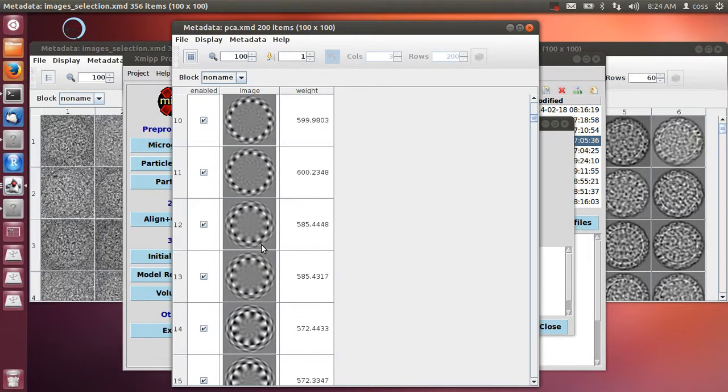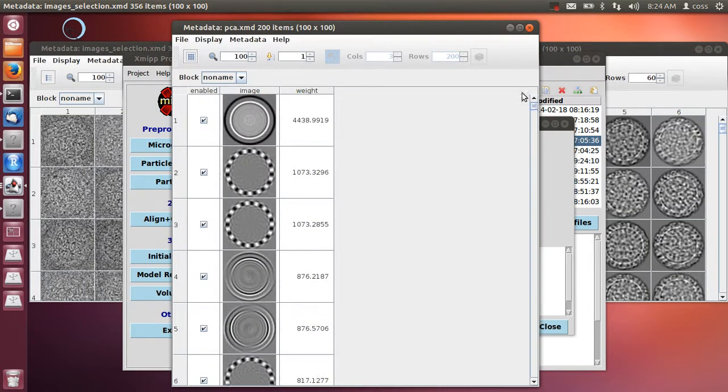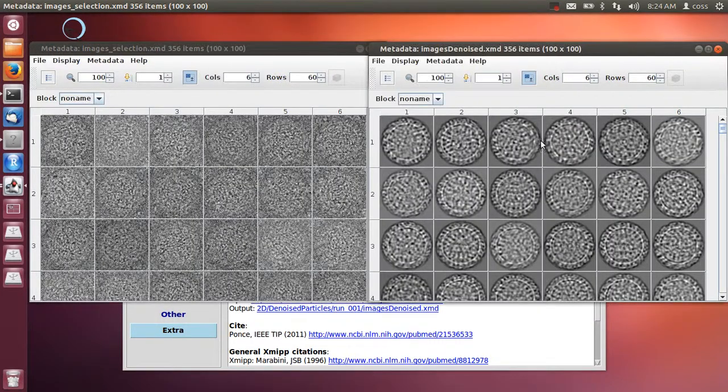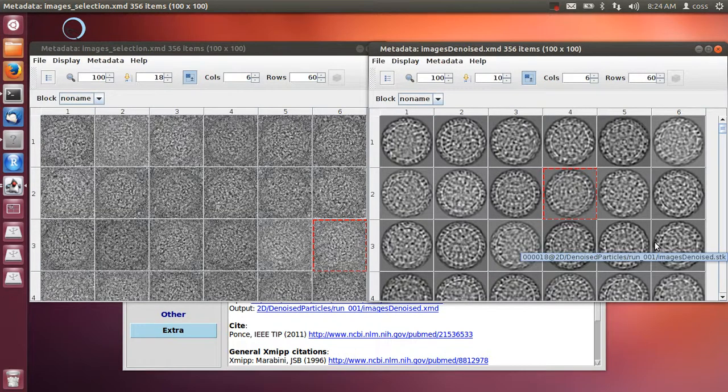So most of the important bases are concentrating on the capsid. Remind, these bases assume that your particles have been already aligned, and once they are aligned, they can be projected onto these bases, and then you can check what is underneath all this noise. So it is a useful view. I wouldn't use these images for classification or for 3D reconstruction because they have lost small details. But otherwise, to look at the particles and to see if you have damaged particles or not, it could be useful.